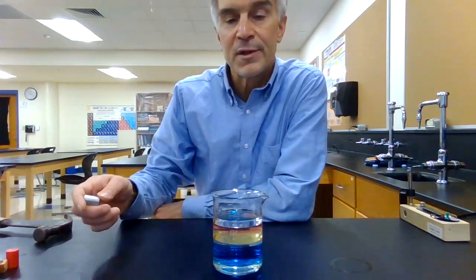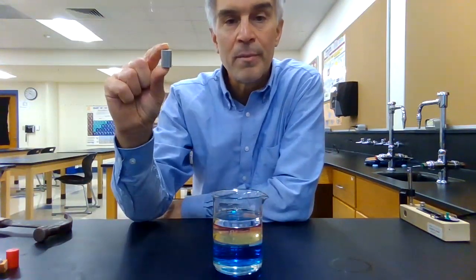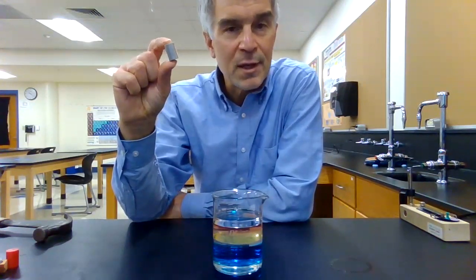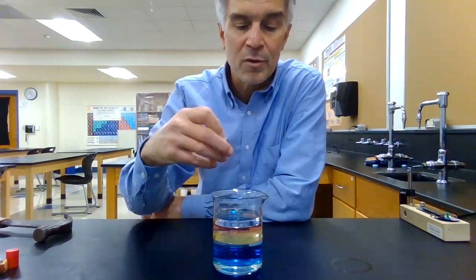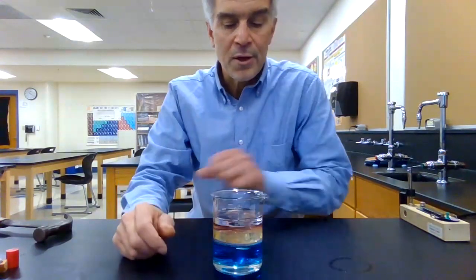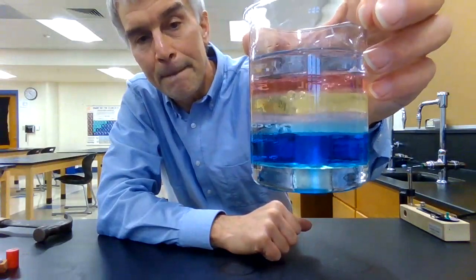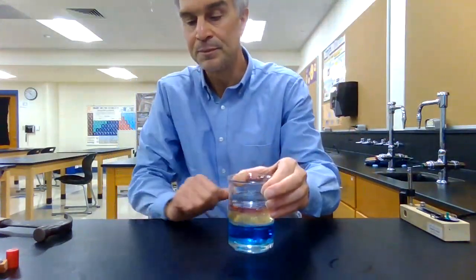All right, now that we have our 6 liquids in the beaker, we're going to see what happens when we start adding the solids. I'm going to start with the most dense first. I'm going to start with aluminum. And you all know from the lab we did recently that aluminum has a density of about 2.7 grams per cubic centimeter. And you can see when I place it in here, it sinks to the bottom. It sinks in all of the liquids.